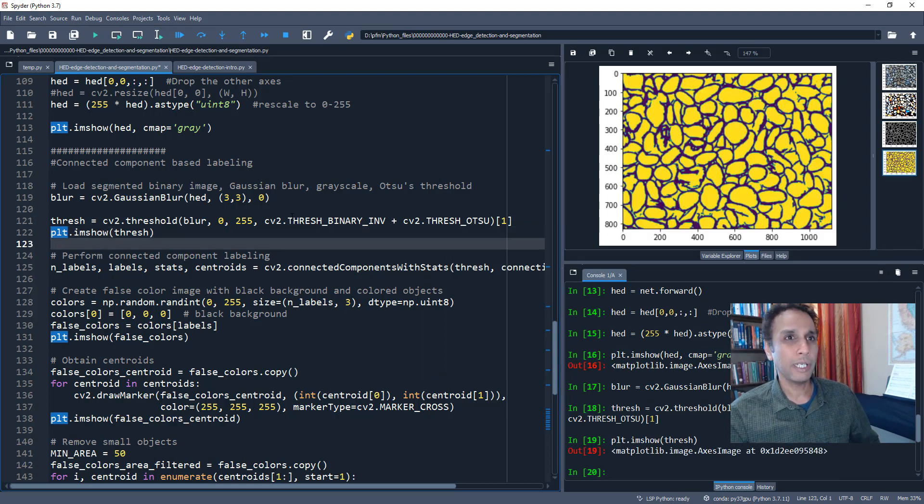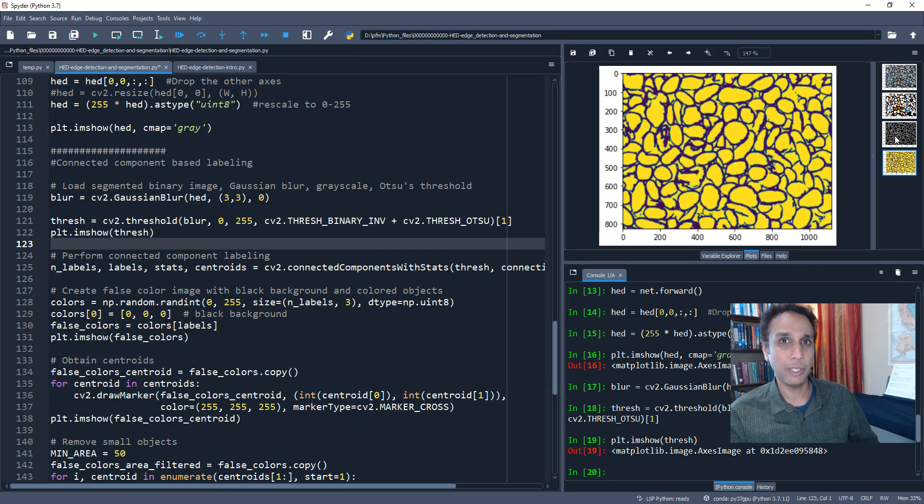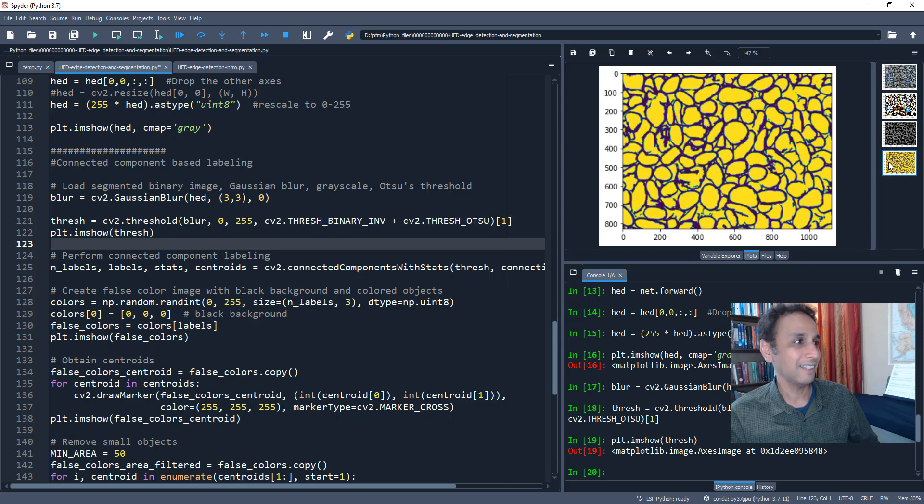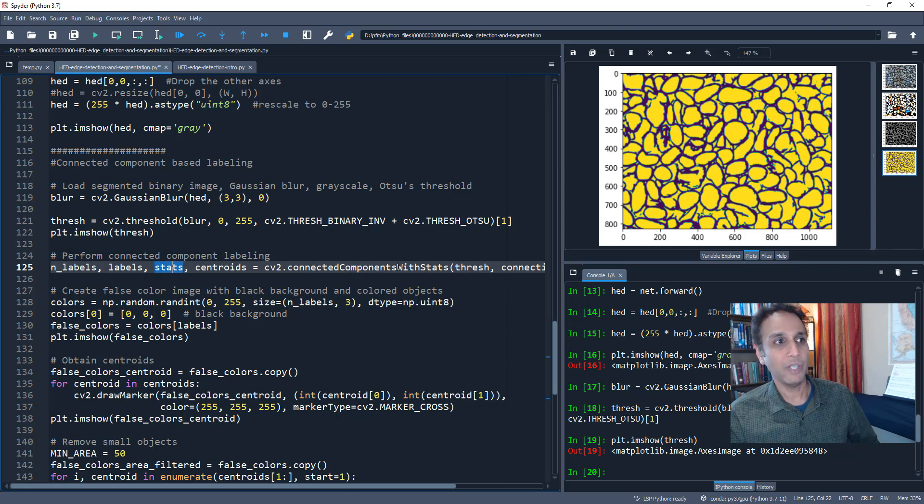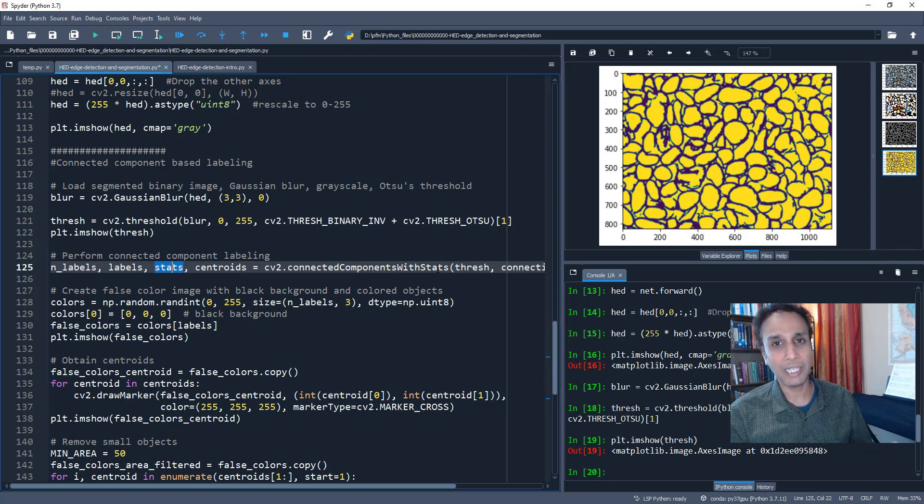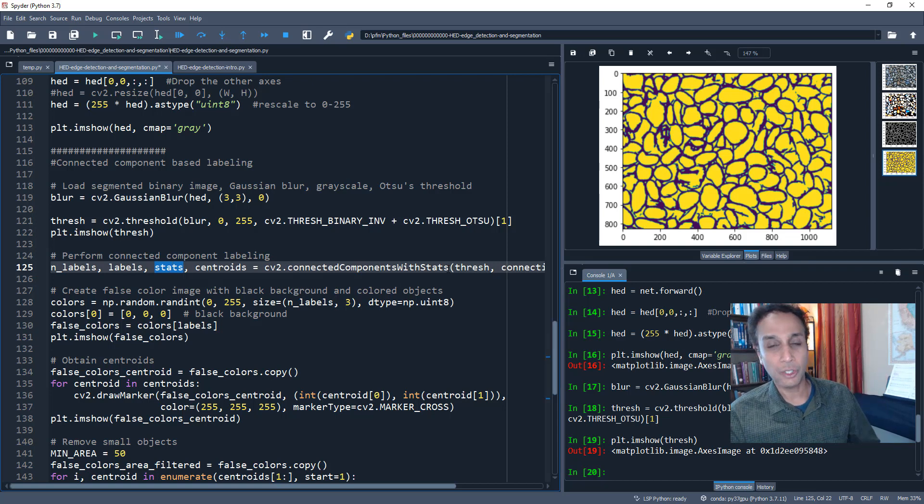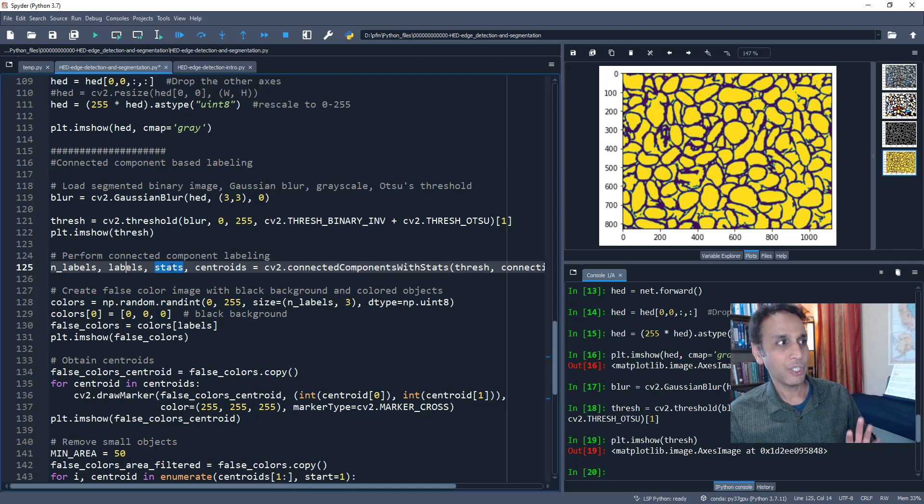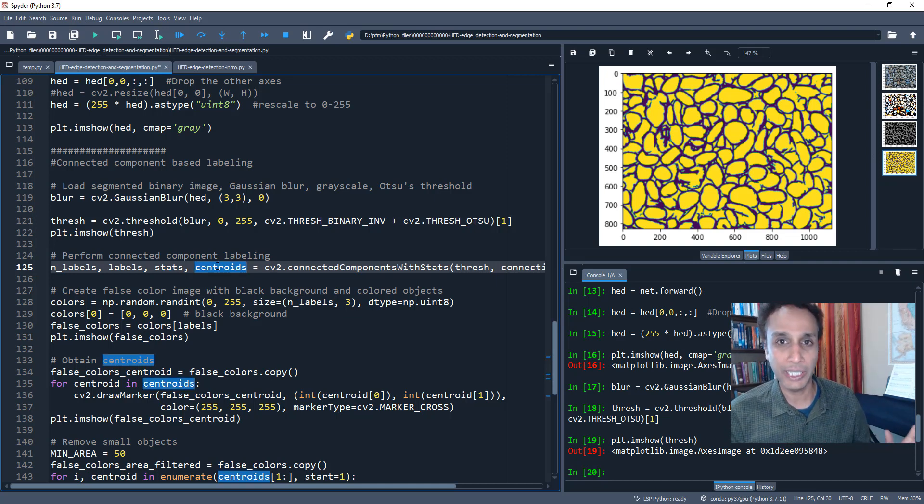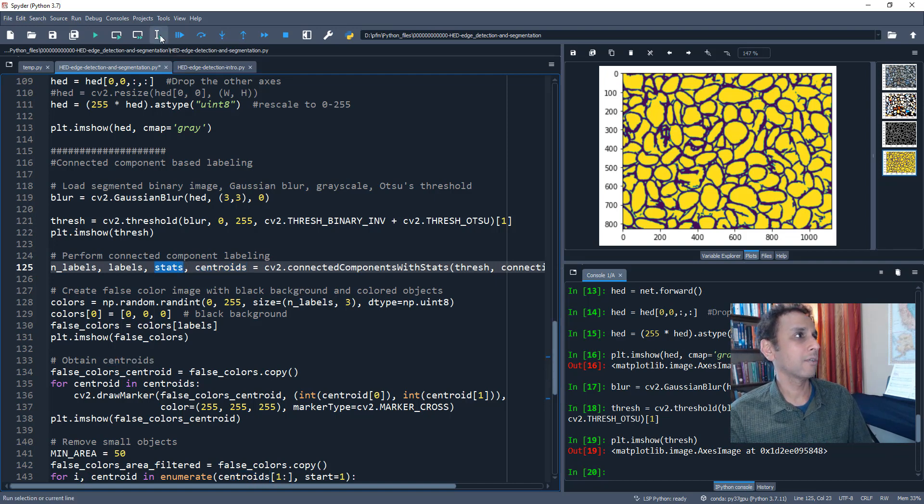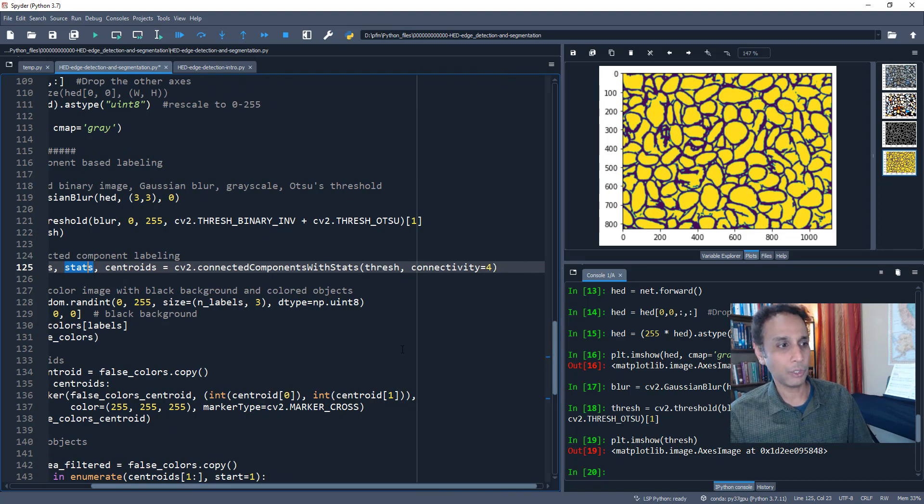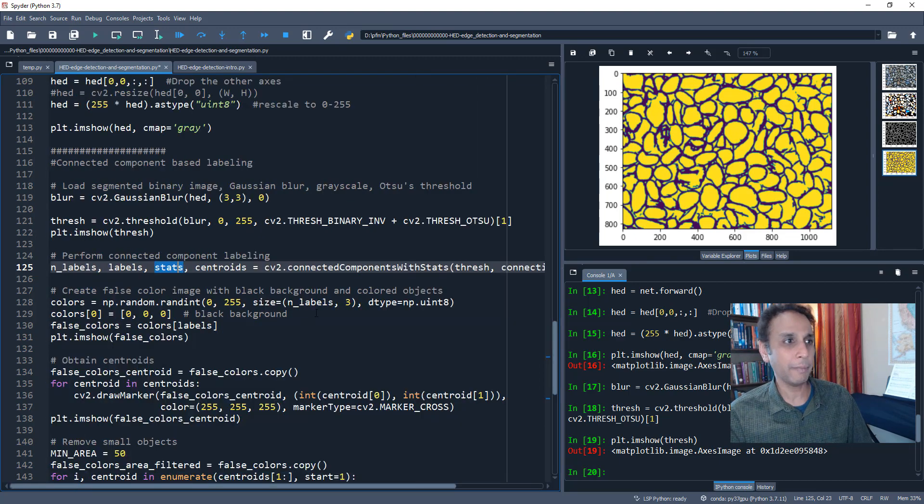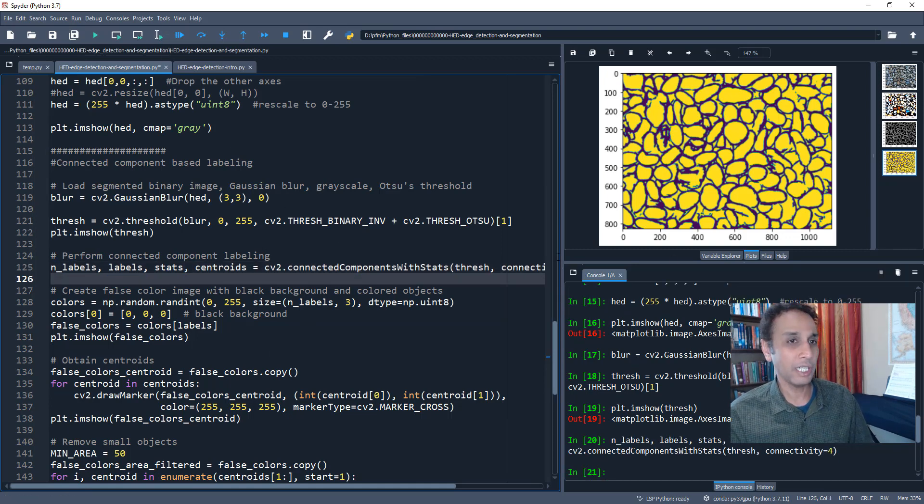Let's look at the thresholded image now. So that is very good. So this is our input image. This is the thresholded image. Isn't that great? Yeah, that is amazing. So now that you have a thresholded image, let's go ahead and apply the connected component. And I'm using the connected component with stats. So even the stats can be extracted. So I can use the area and all that to filter the image, for example. Yeah. So when you do connected components with stats, it's going to give you four outputs, number of labels, the labels itself, stats of each of these objects, and the centroids of each detected object, all relevant information that we need. So let's go ahead and apply the connected components right there. And can you see the right hand side? And the connectivity equals to four. Again, you can play with all the parameters to see how it works for your own images. So let's go ahead and run it.